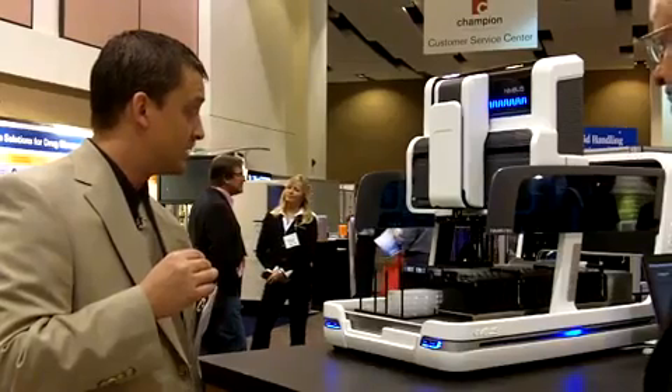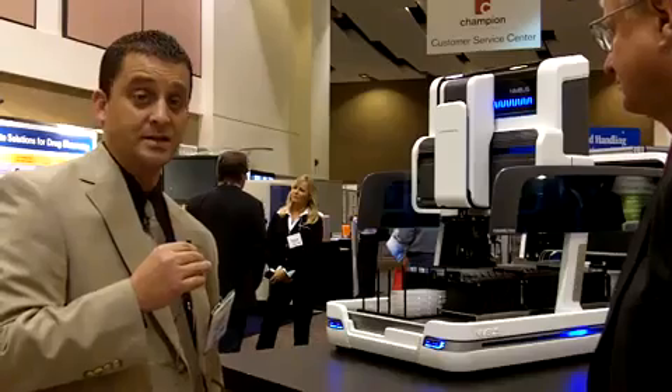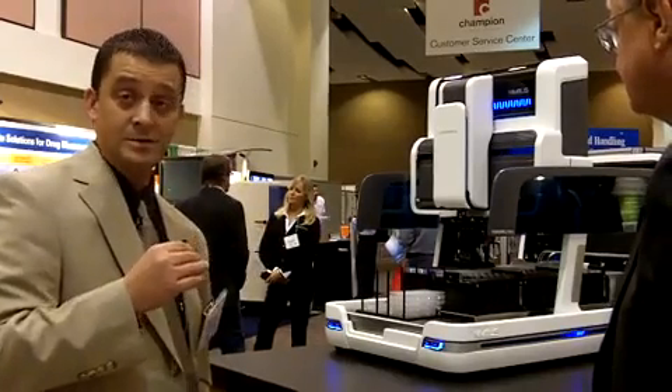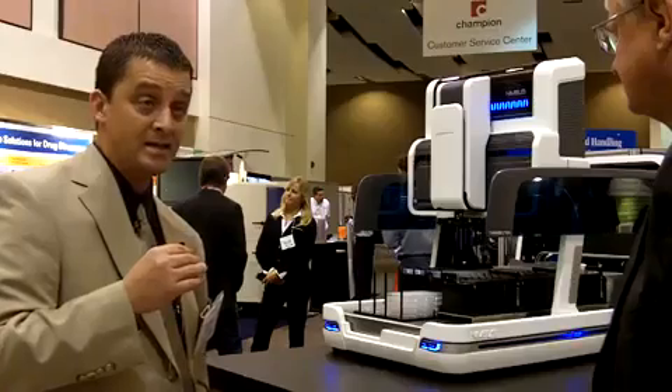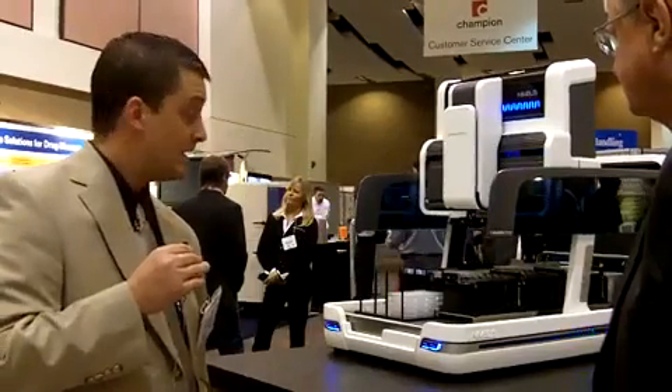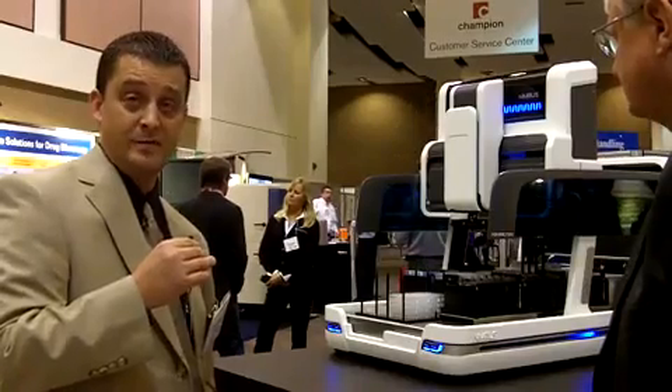What's also interesting about this platform is that it uses the same pipetting technology as our larger platforms — our larger STAR line of automated liquid handlers. So you get compact size, flexibility, and performance in a small, compact, price-efficient platform.